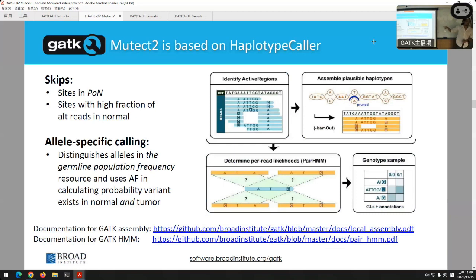Because of that, we make modifications to the HaplotypeCaller here. One of the big ones is where we use the panel of normals. This is where, for instance, we toss out variants if we see them frequently inside the panel of normals. We'll just toss them here, assuming they're artifacts. Also, if you see a large number of variations in your normal samples, assume that might be a noisy spot. Assume it might be noisy, and toss it there too.